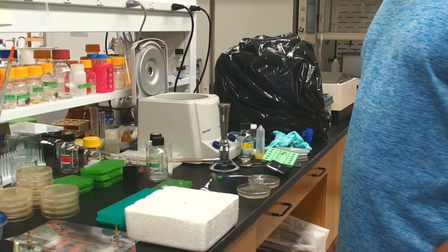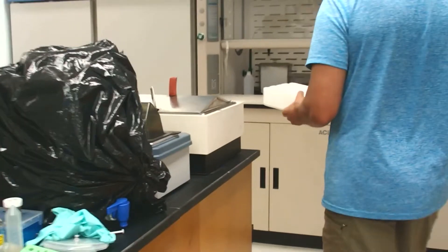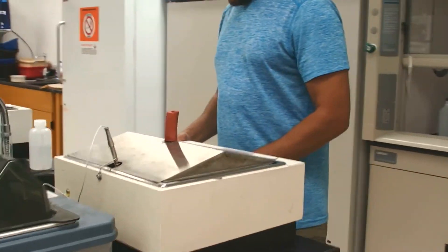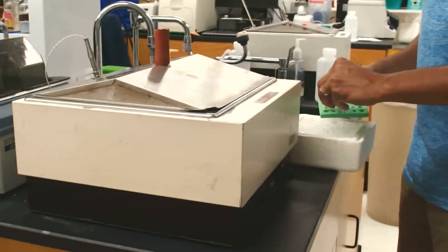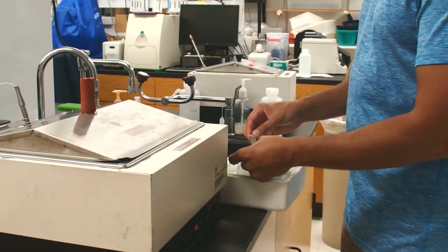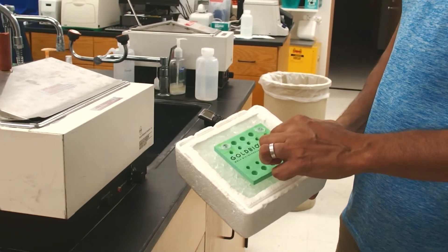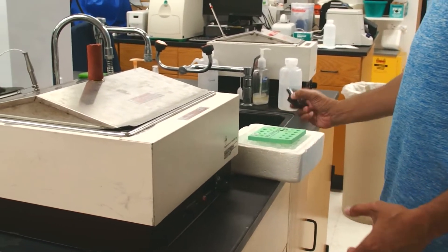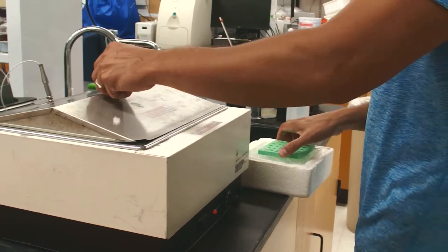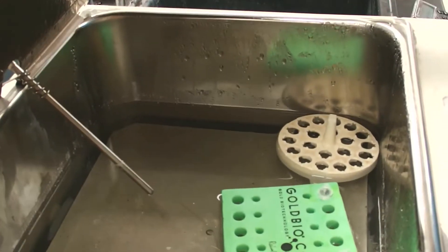You do not need to let them sit on ice for many minutes. To do the transformation, we're going to heat shock in a 42°C water bath for 45 seconds. I'm going to transfer the transformation tubes into a foam rack that will float — it's still on ice right now. My timer is set at 45 seconds, so I'm going to drop them into this water bath and start the timer.